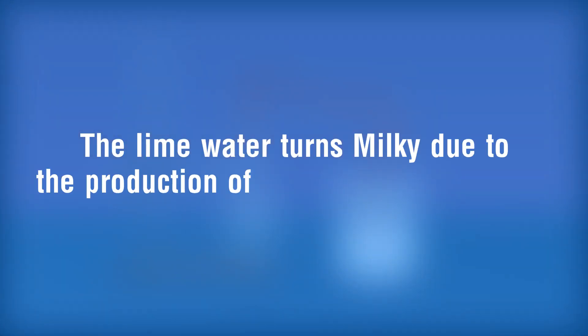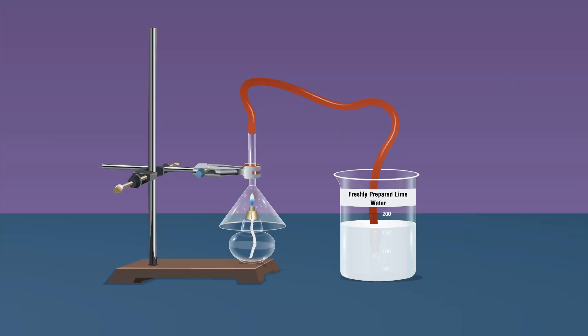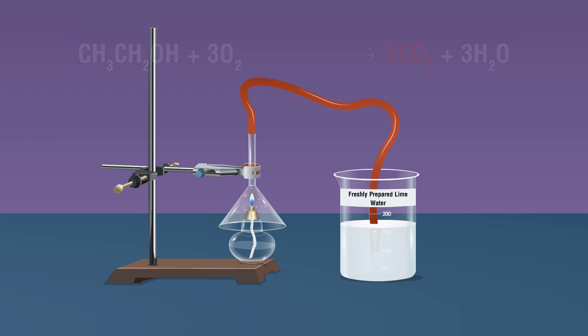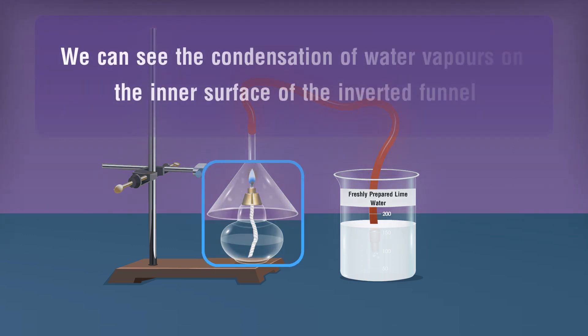CH3CH2OH + 3O2 gives 2CO2 + 3H2O. Observation 2: We can see the condensation of water vapors on the inner surface of the inverted funnel.